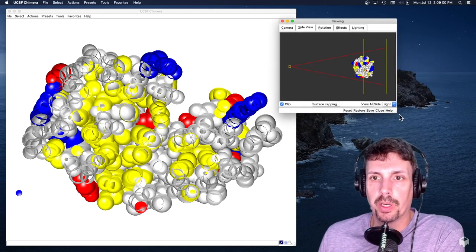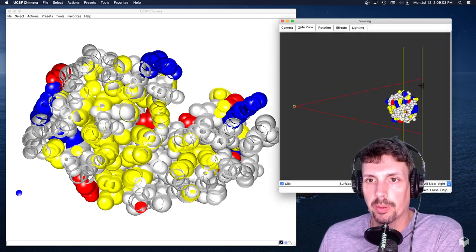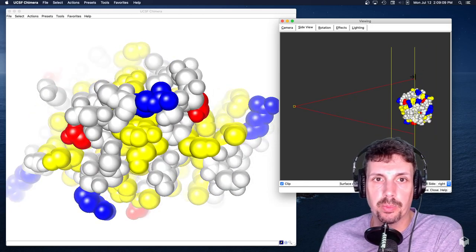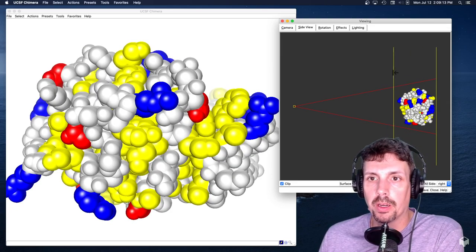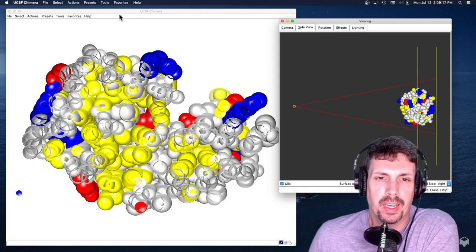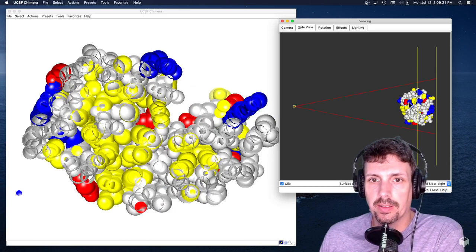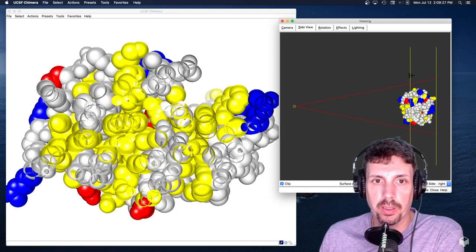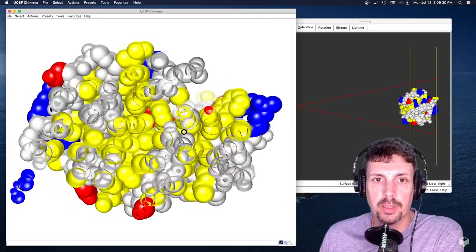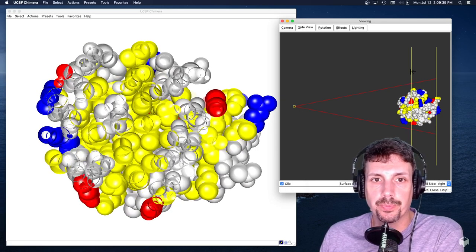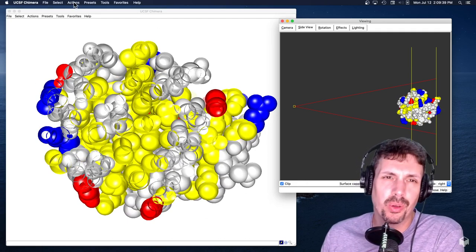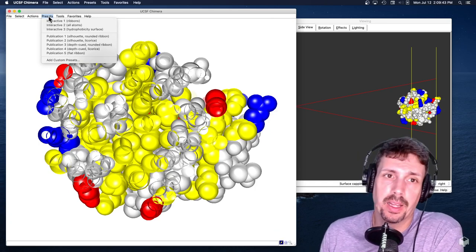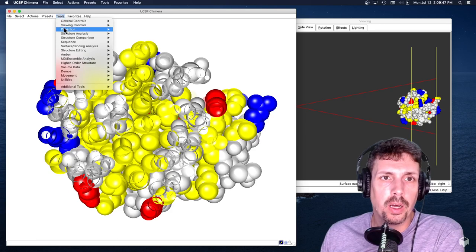You can always make these windows bigger if you really want to fine-tune things. I always like to cut the back plane. So what happens is the lighting is, it kind of controls how the lighting is. So I kind of like delete the back away by moving this plane up, right? But here I'm interested in cutting the protein in half. So I can look on the inside. I mean, it's not great because, but you can, what you're seeing here is that the inside of the protein is predominantly hydrophobic. I'm going to move our line out a little bit. Right. If I put it right there. Right. There's lots of yellow on the inside where all the charge is on the outside. And most of the white is on the outside too. Although you can't completely get rid of this. A lot of the backbone needs to go into the hydrophobic core as well.